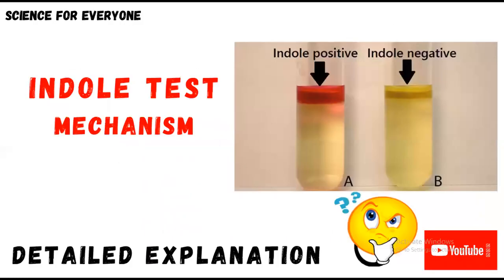We have discussed the principle of it, the procedure of it, and I have also added the test form. And at the last, we have the most important part, that we understand the chemical reaction that is taking place inside the indole test, and why red color appears and why there is no color. So we also discussed it there.